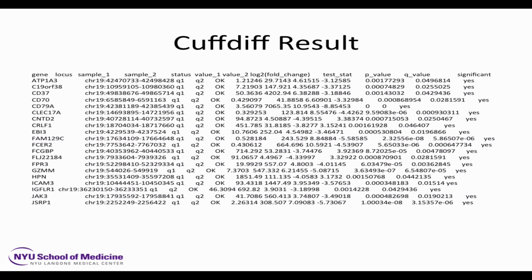Yeah? Is there a way to convert SRA files to FASTQ files? Yes. How do we do that? There is a SRA toolkit already installed on the cluster, and I can send you a set of instructions. It was an exercise in my class last week. It's not hard. It's a one-command thing.